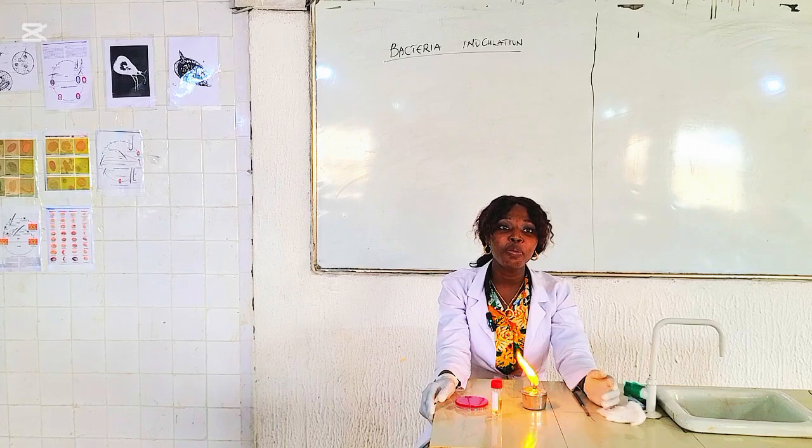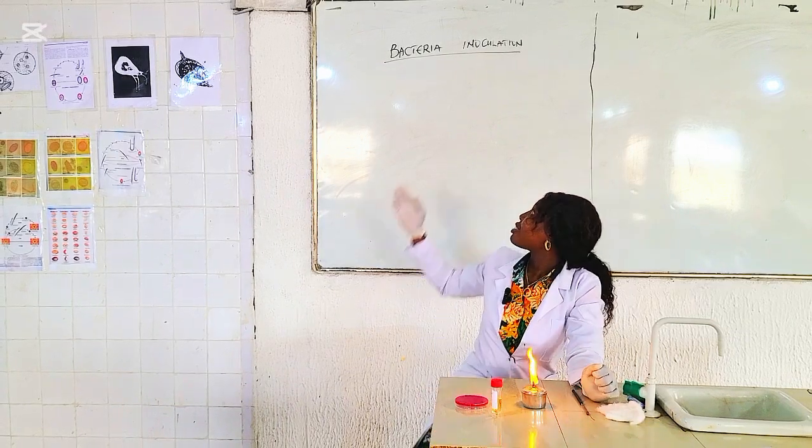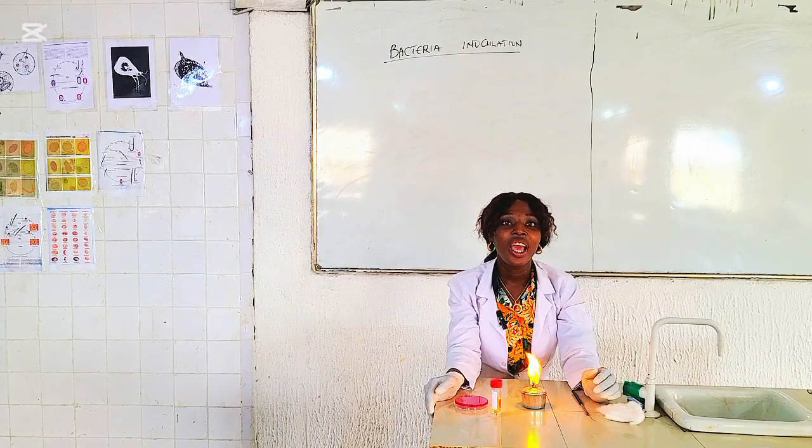For today's learning purpose, we're talking about bacterial inoculation.